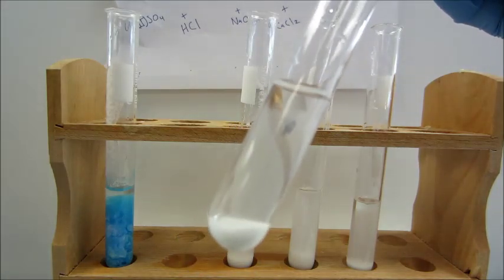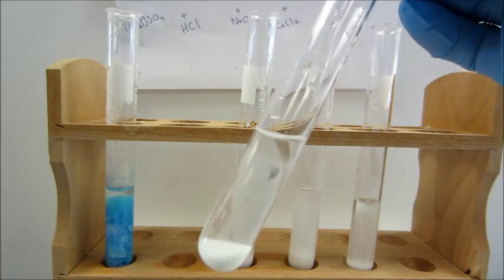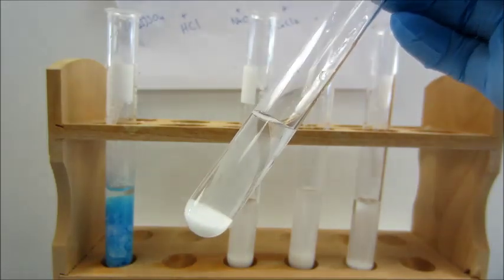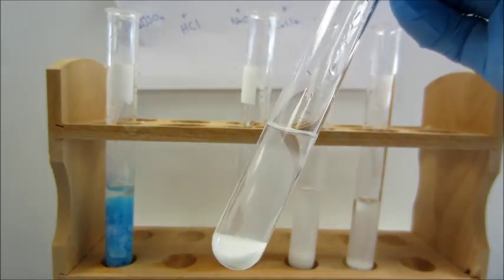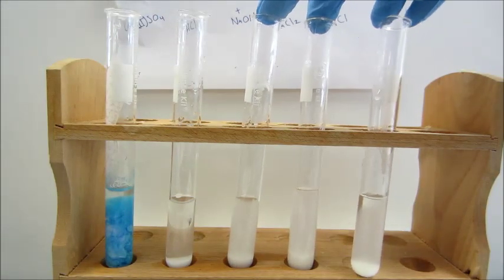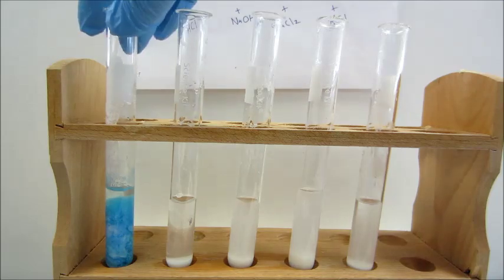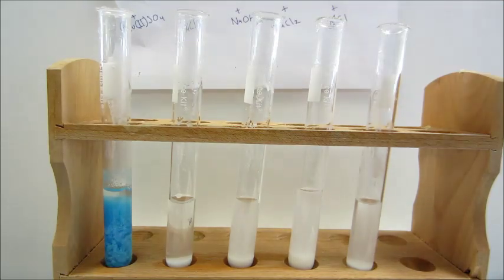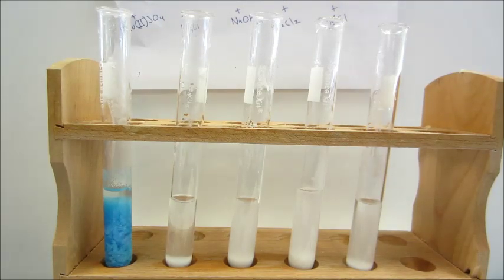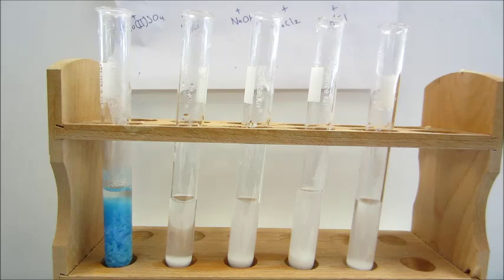If we formed soluble compounds, why did this reaction happen? It's because water was formed. Water is a covalent compound, and one of the reasons for a double displacement reaction to happen is the formation of a covalent compound. For this activity series, we did not have any reactions with the three on the right — sodium hydroxide, calcium chloride, and potassium chloride. We did have reactions with copper sulfate, where a solid (calcium sulfate) was formed, and with hydrochloric acid, where it basically neutralized to form water. Hydrochloric acid is a strong acid, and calcium hydroxide is a base.